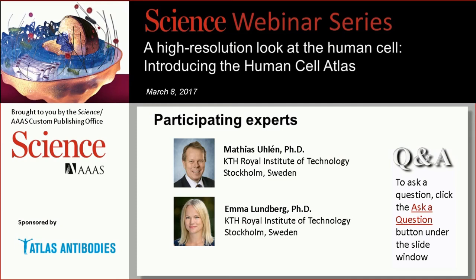So sometimes we can get super bright signals of, for example, a centrosomal protein or a protein localized to nuclear bodies, even though the actual copy number of that protein is very low. They're localized to a very distinct part of the cell, and then we get a high signal. Whereas if we would lyse the cells and run mass spectrometry or a Western blot, we might not be able to detect that protein because we disrupt this high local concentration. So I would say it's a very good method to detect low abundant proteins, as long as they are specifically localized.